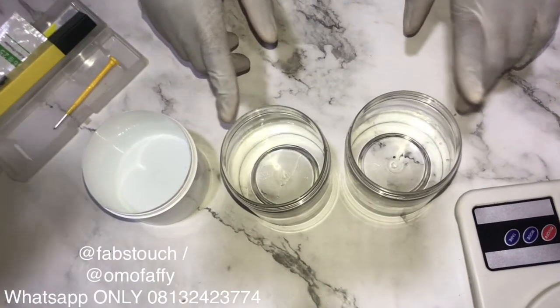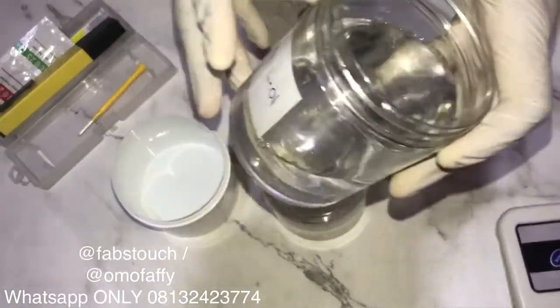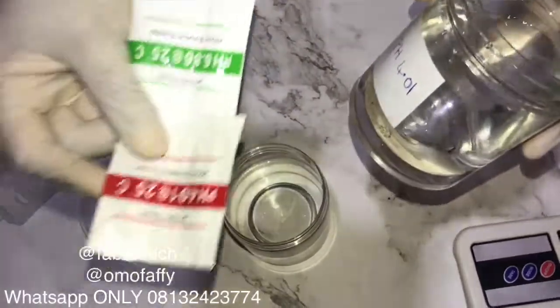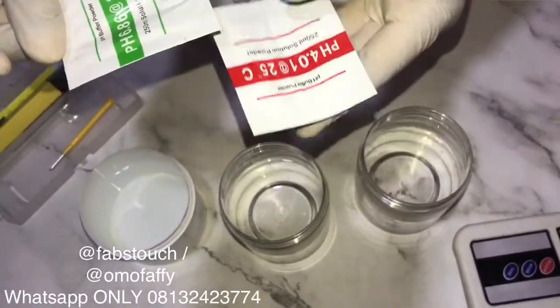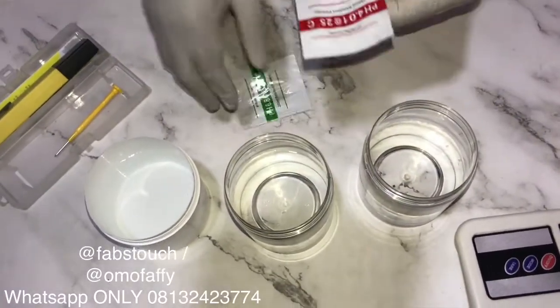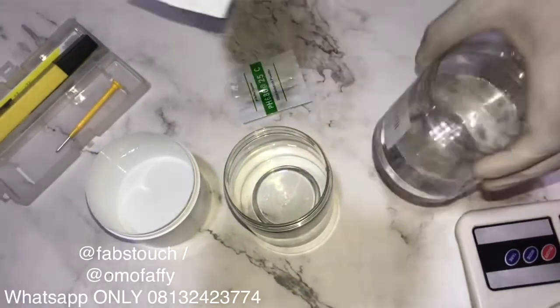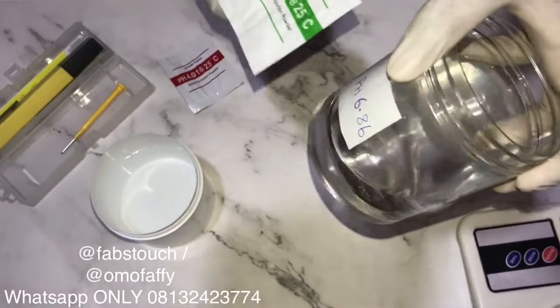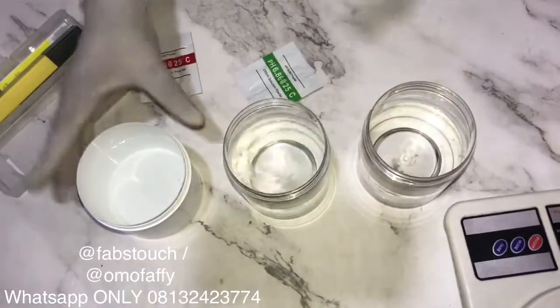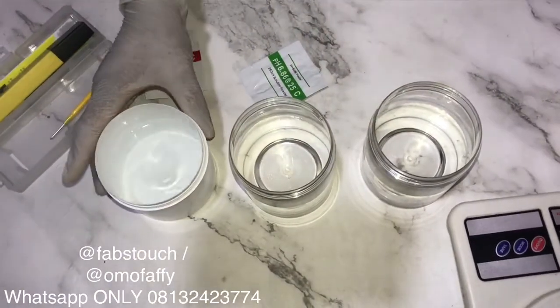Here I have three jars, each filled with 250ml of water. I've also labeled each jar to fit each of the buffer powders I'm going to be pouring into them. I have two buffer powders — the first one is pH 4.01 and the second one is pH 6.86.